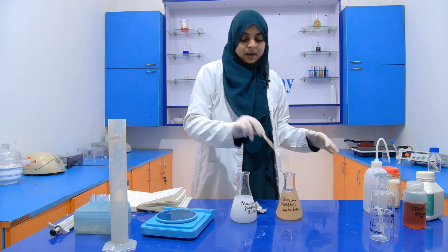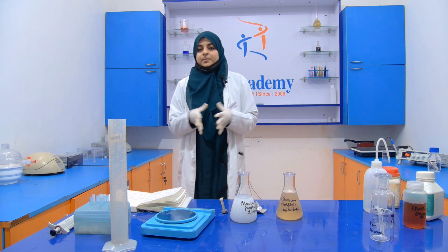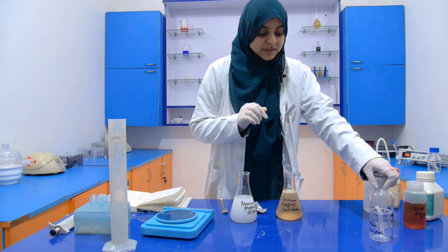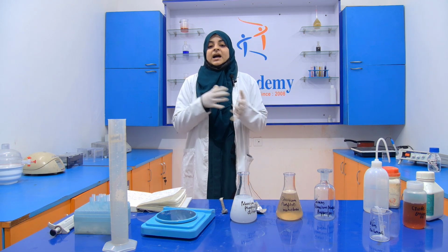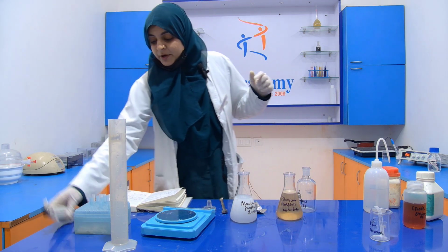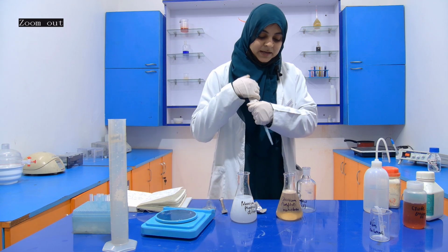Now with the help of this, we are going to prepare our potassium phosphate buffer. For this, we take 5 ml of monobasic and 5 ml of the dibasic. Then we maintain its pH at 7, and after that we make the volume 100 ml. So first of all, I am going to take 5 ml of monobasic.